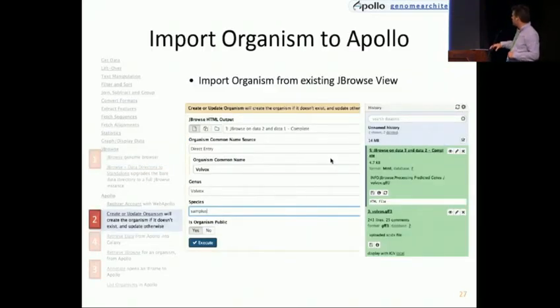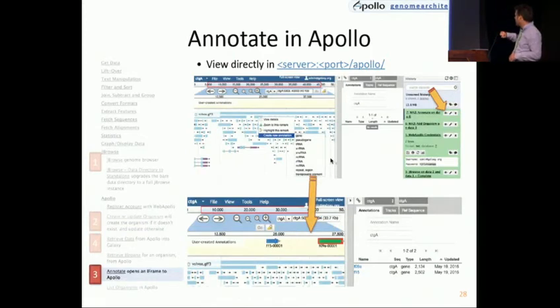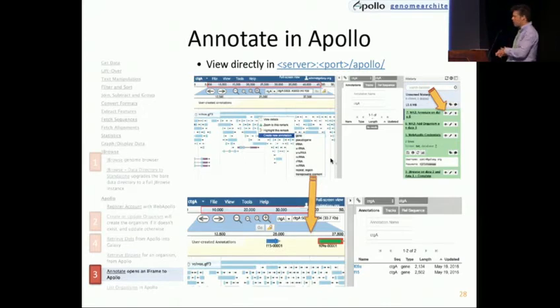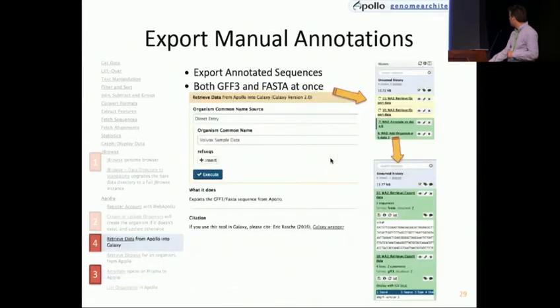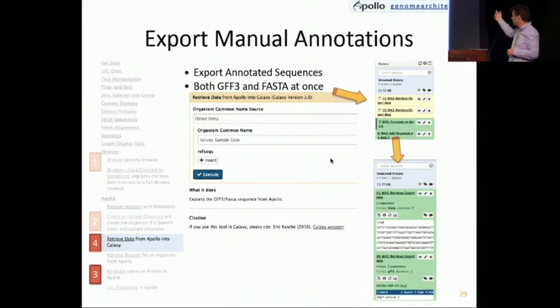Once you have that JBrowse data, you can add it or create an organism based on that. Once you have that built in, you click on the view and then you can annotate. Since it's Docker, it's actually a separate server running off of Docker, so you can connect to Apollo directly. I would get rid of the left-hand panel — too many iframes and it doesn't work quite right. But you just get rid of that and it works quite nicely. You can create annotations, and once created, you can export directly from Apollo, or the cool thing working with Galaxy is you can export them directly back into the workflow — GFF3 and FASTA — and create additional evidence using that.